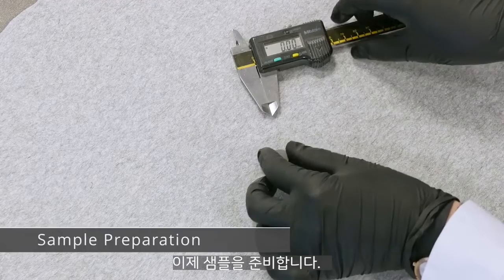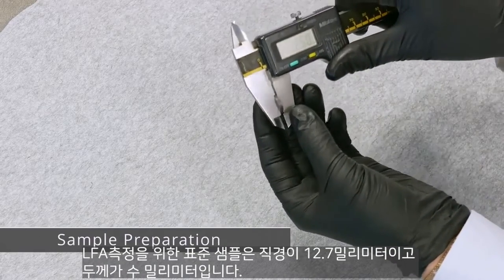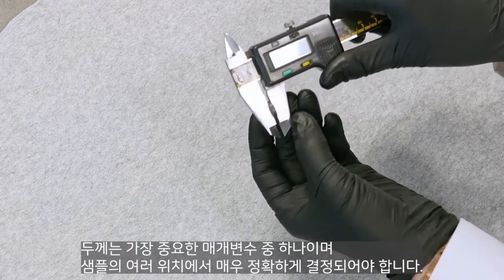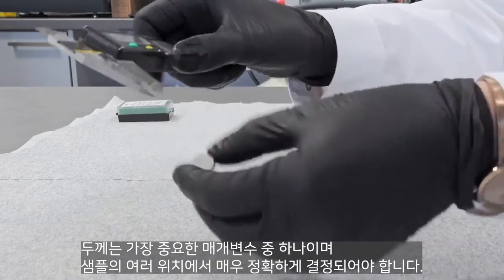Then the sample must be prepared. A standard sample for an LFA measurement is 12.7 mm in diameter and a few mm in thickness. The thickness is one of the most important parameters and should be determined very precisely and at several positions of the sample.